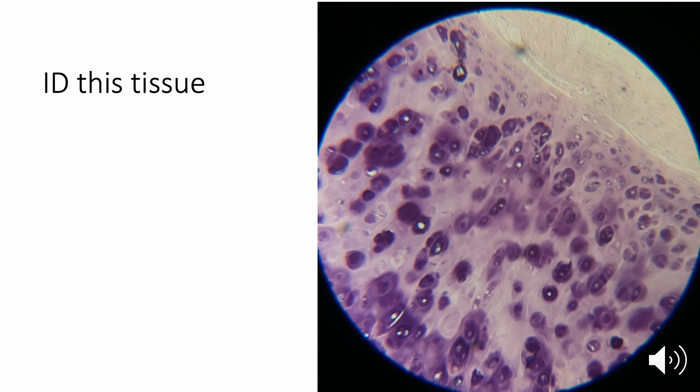Next tissue. So I'm looking right in this area, and again, you'd have a pointer on the exam to determine exactly where it is I want you to look. So I see cells that are scattered, but no empty space, no apical surface. It is not an epithelial tissue. And I see what looks like kind of bubbles or these empty pockets in the tissue. So those are my lacunae, and the purple dots in the middle there, those would be the chondrocytes.